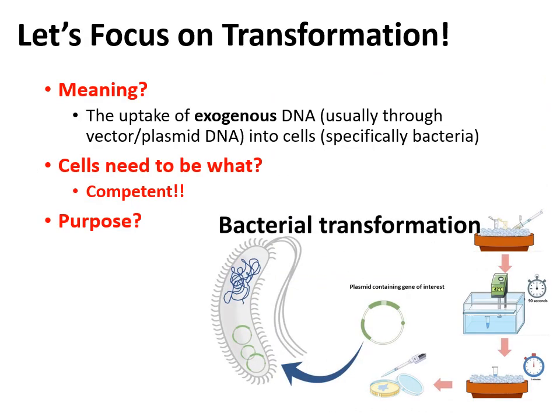Okay, so now that you're all experts on the 3 possible types of gene transfer when we talk about bacteria, now we're going to focus on our experiment today, which is transformation.